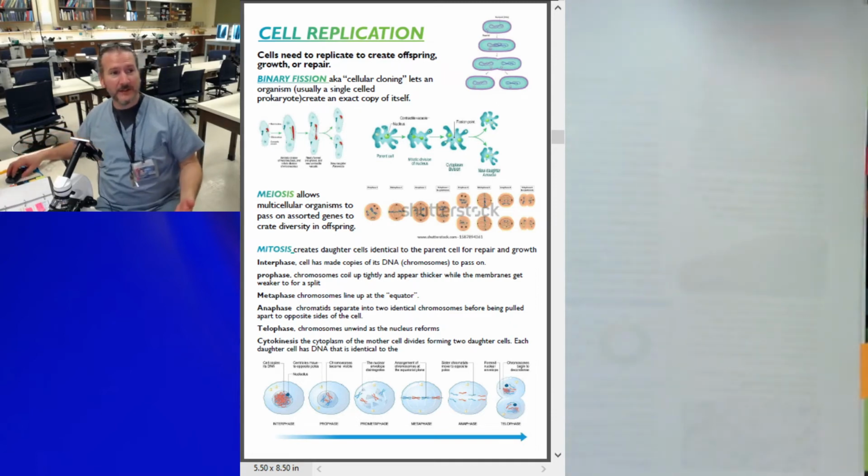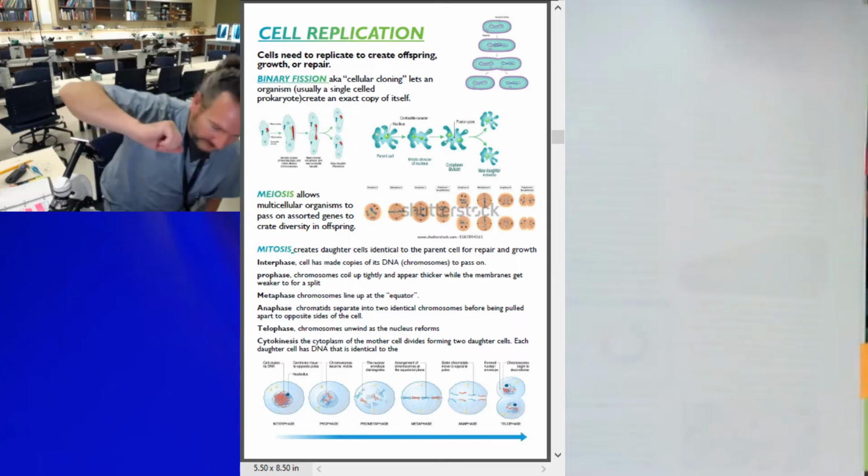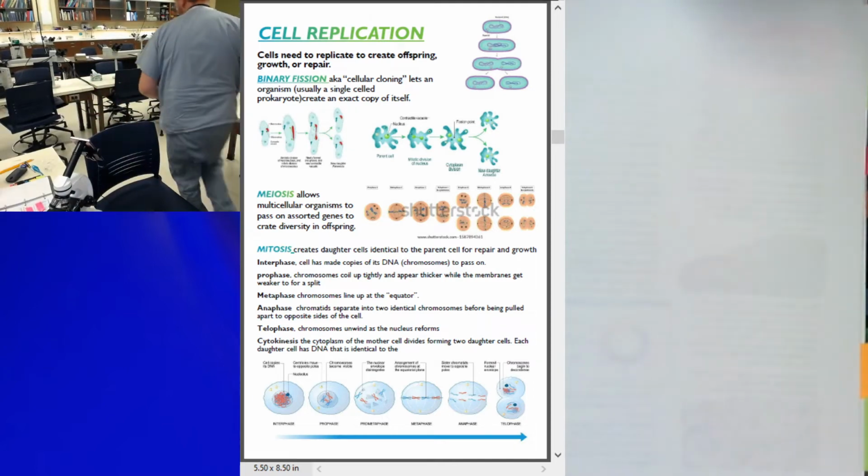And before you know it, you will have rehydrated onion.